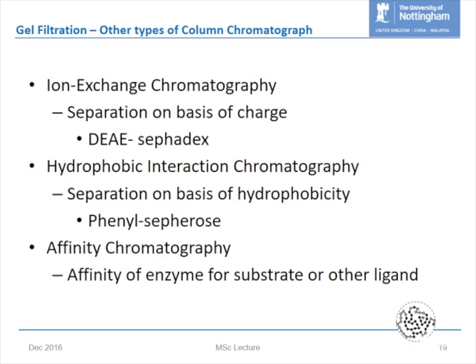But that's the problem. What you sometimes have is peaks coming out the end, and you've still got some material on the bed. But you can change the solvent strength by changing the ratio of your solvents. For example, in reverse phase, you might inject in water, and then to move your molecules through the column, you can increase the amount of methanol in your system up to 100% methanol.